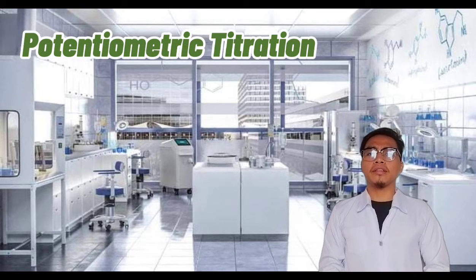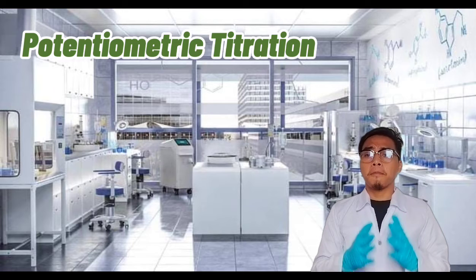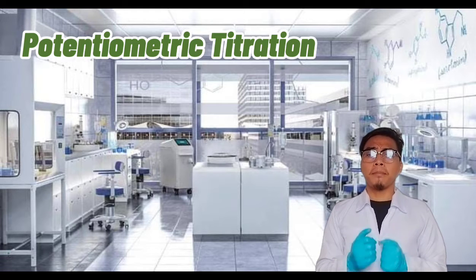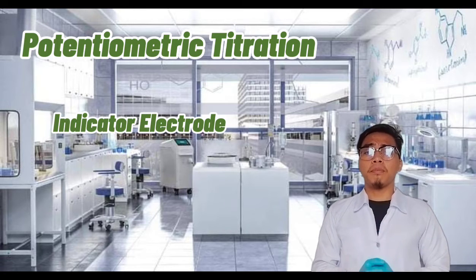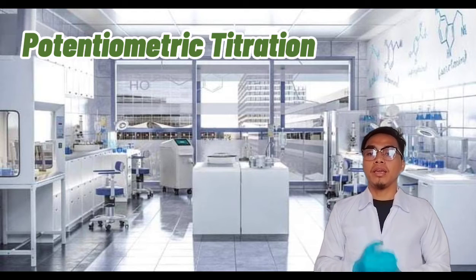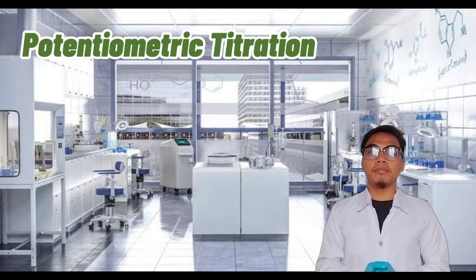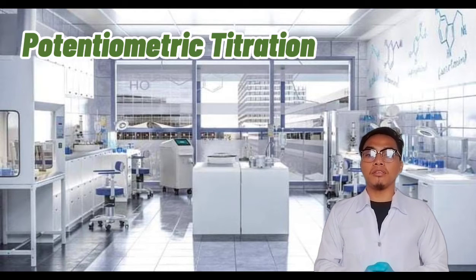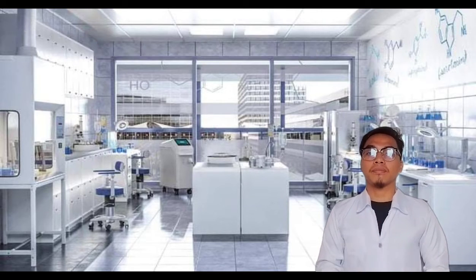Now, let's start. Potentiometric titration is a titration used to measure the amount of analyte present in the given solution by measuring the change in the potential by a suitable indicator electrode as a function of volume of titrant. It is the procedure through which the quantity of the given test substance is determined by the measured addition of titrant until the entire test substance undergoes reaction.